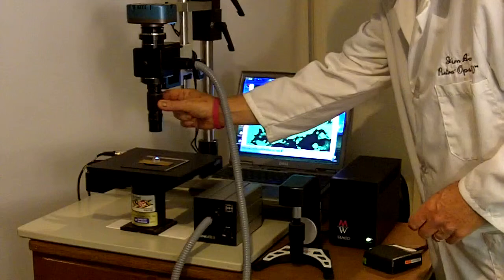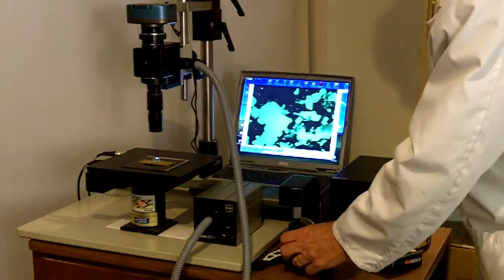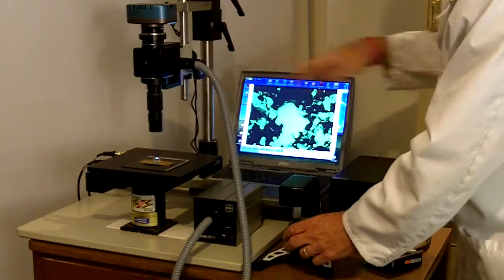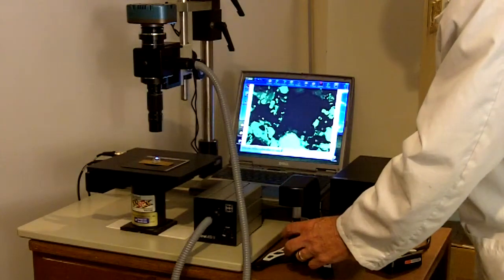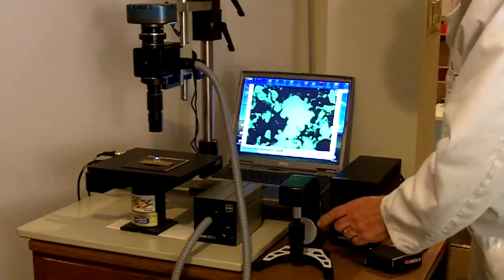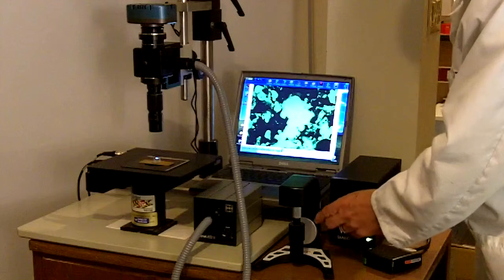Here you can see how we internally focus. And then once we've found focus we can quickly scan without touching the sample field. We now have a remote XY movement and a configuration to control fine focus via stepper motors.